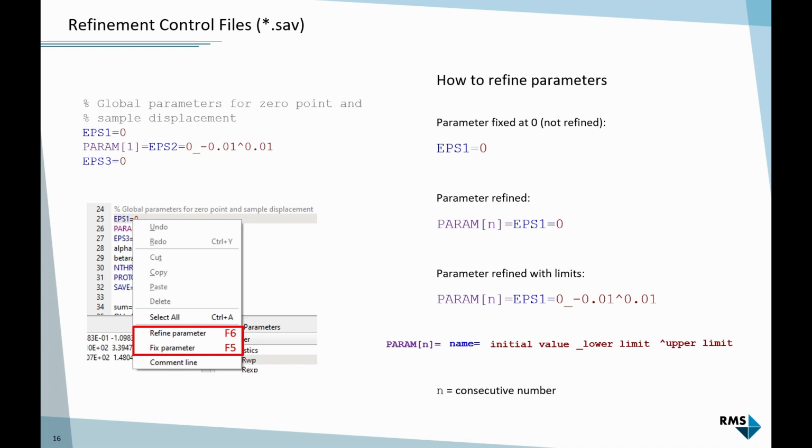One more thing, sometimes it is possible to select from the menu refine anisotropically for parameters that cannot be refined anisotropically. For example, coordinates or the cell parameters. These are not anisotropic parameters. So if you choose anisotropic refinement, Profex just removes the limits, which is kind of an interpretation of refine more or refine without limits, something like that.